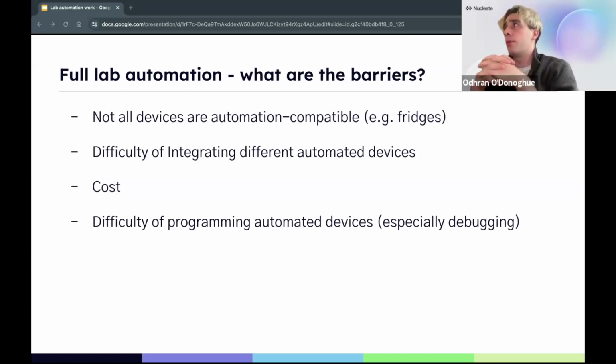Firstly, there isn't really the immediate financial pressure from any scientific manufacturer to make their device automatable. Let's take a scientific fridge that needs to go down to minus 50 degrees. That is a very high margin, very lucrative business. You don't need to make an automated fridge to be a good scientific fridge company. So there's not really a consideration of how these things might be automated, and so there isn't a consideration of how a robot can open a fridge.